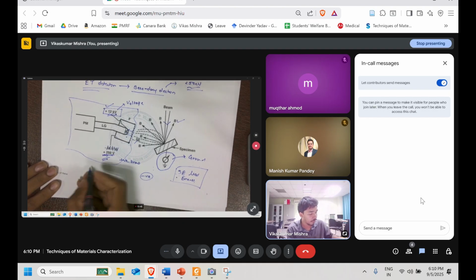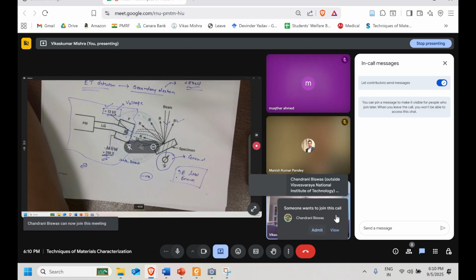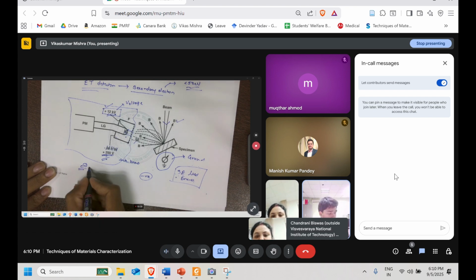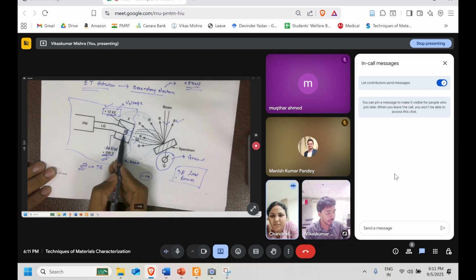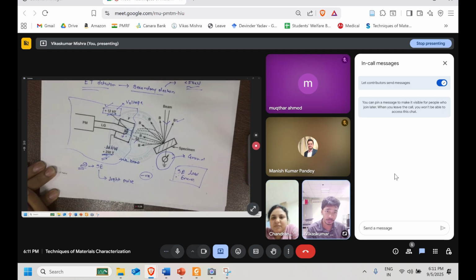So what we did: we got the secondary electron signal and accelerated it. After that much acceleration, it excited this particular scintillator, which is a phosphor. After that excitation, the signal is converted to light. It will convert it to an optic pulse.